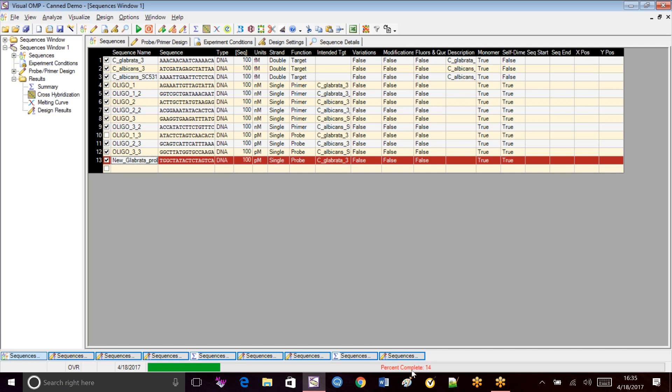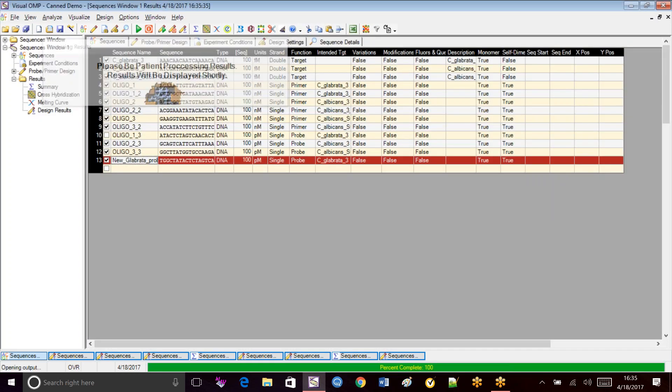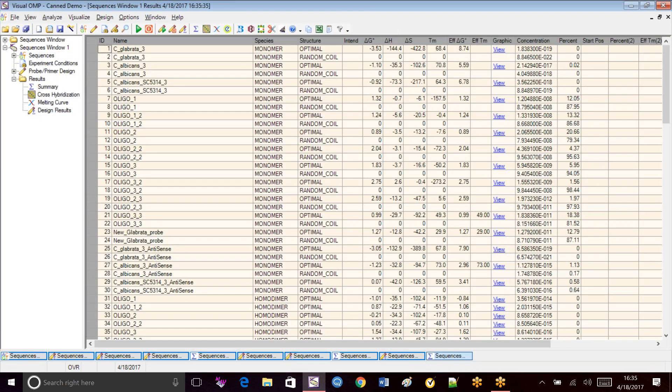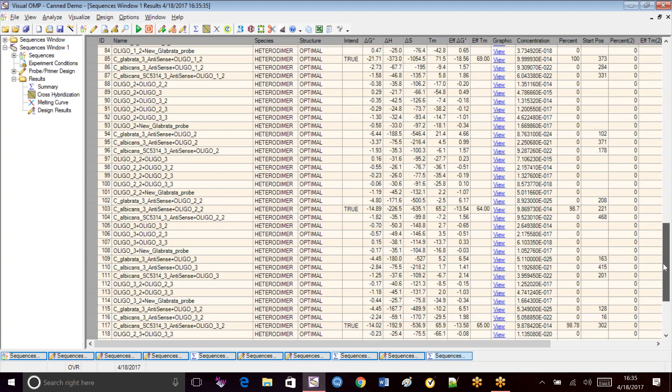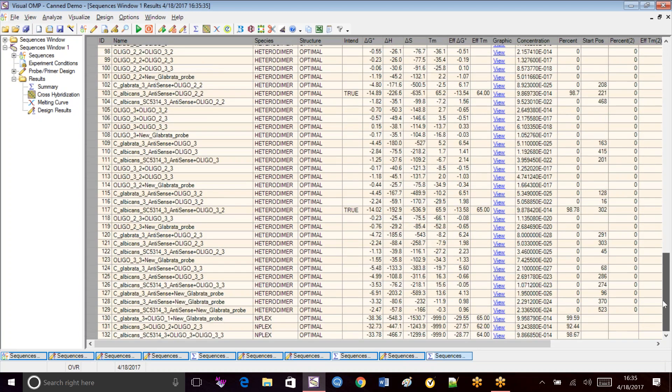So we just watch the progress bar and see how that goes. So when you have brand new primers and probes that you brought in from outside, say you designed them someplace else, there are many more considerations in optimizing your multiplex. But if you design them in VisualOmp, then VisualOmp will make sure that their probes are not being designed for any secondary structure in the target. And also that they're not forming any hairpins. So we took our new Glibrata probe.